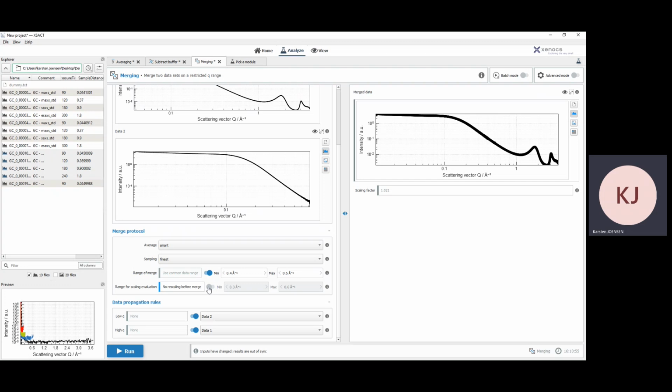I really don't like the scaling because I think that the data that we have should overlap, and if they don't overlap in any major way, then there could be a number of other issues, such as subtraction of cosmic background not being done correctly, or other kinds of scaling issues. It could also be an indication that the sample to detector distance is not correctly calibrated, if there are scaling issues. It's there because the intensity actually scales with 1 over the sample to detector distance squared. So it's a fairly sensitive measurement of whether those distances are correct.